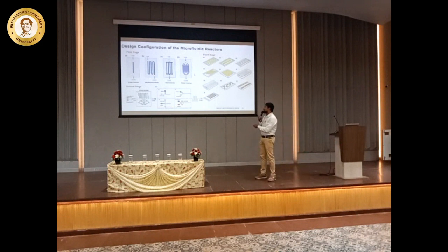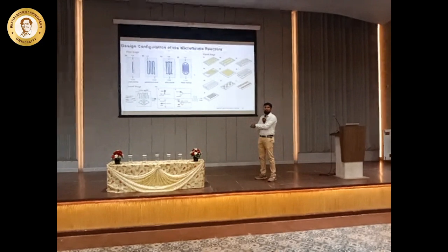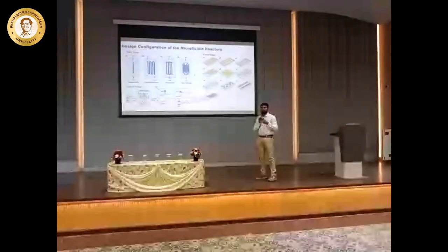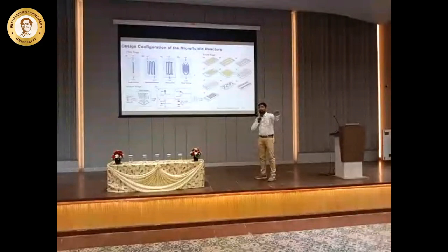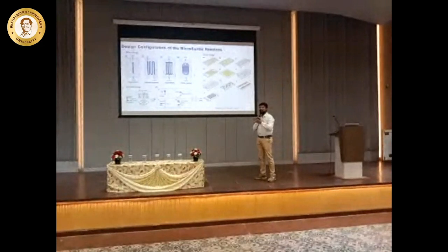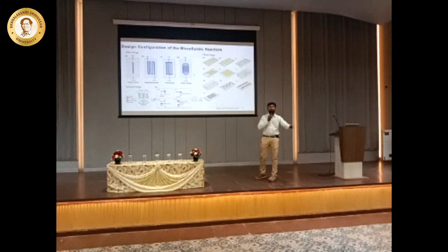And we have different channels, and now the second stage is droplet formation. How is this mixing going to take place? Sir, you said this channel, it's fine, it's mixing. But if it is going to be a droplet, how is it going to change? You take a ball and you hit it on the wall. What happens? It doesn't come back. I mean, if it's a different structure, it hits there and it goes there. When the ball rotates, it's not going to rotate in the same direction. It will revolve, and it hits on this and it revolves at the other side. So what happens if I put a liquid into it? So again, I'm making a reaction chamber there.